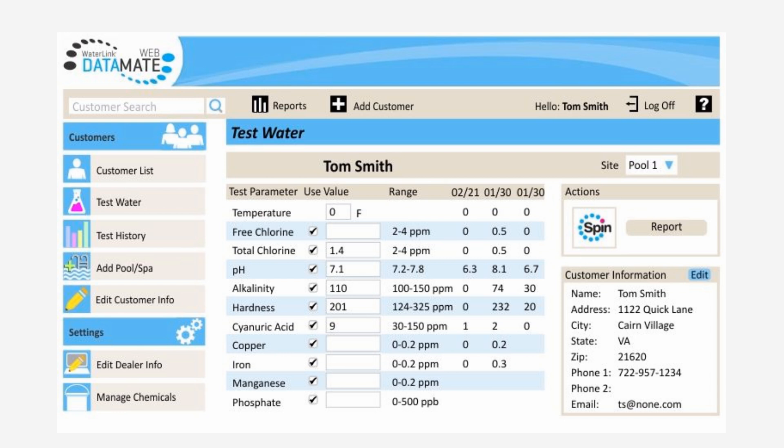These test results go automatically into the analysis software, which calculates exact treatments for that specific pool or spa. The whole process only takes 60 seconds to complete.